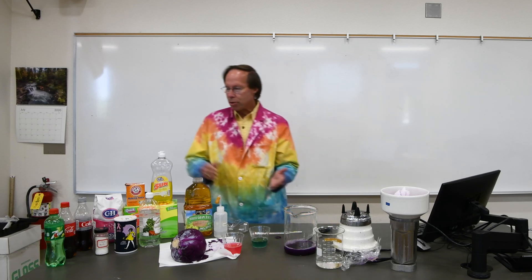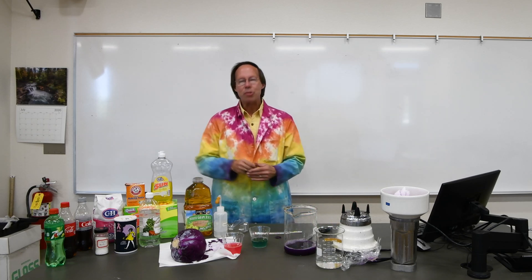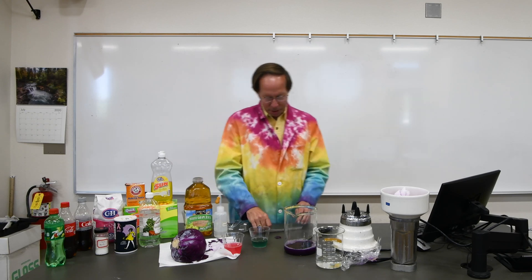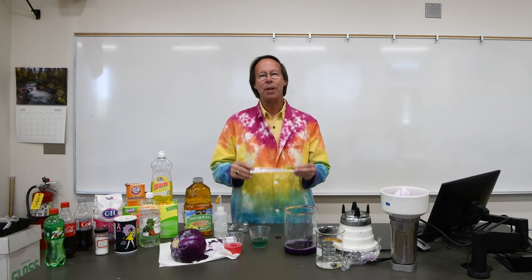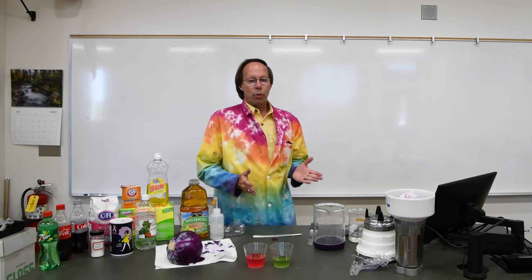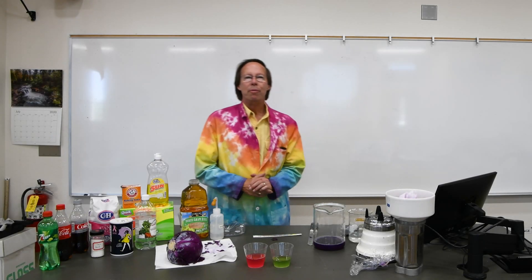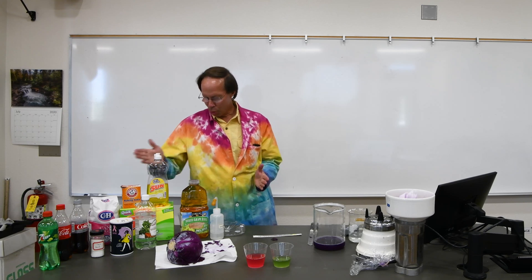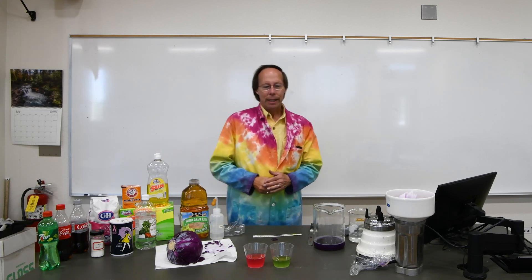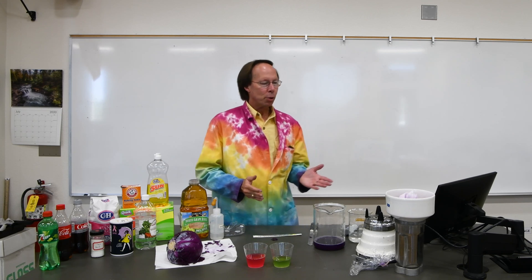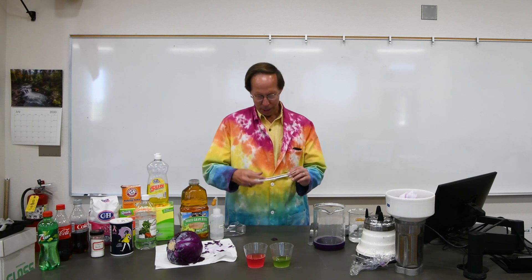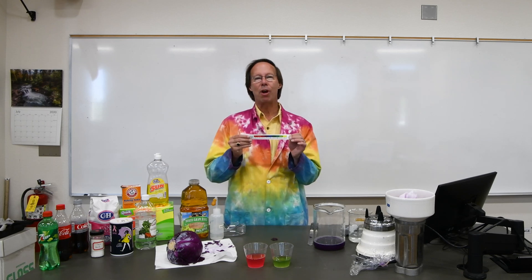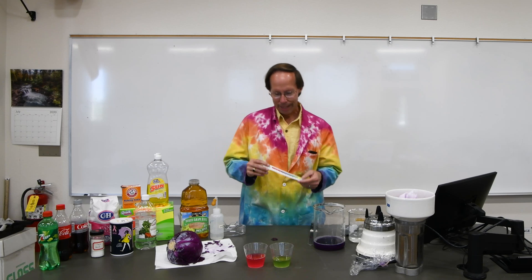So in the lab today, you guys are going to be testing a bunch of different household products. And then by comparing the colors to our little color chart, you'll be able to come up with an estimate for the pH values. You'll be testing a total of 10 different household products. I've got them all laid out here. And getting an estimate of the pH. In fact, if you look in the lab book, in the table it says approximate pH because you can't get a very precise pH value with cabbage juice. But it gives us a pretty good estimate.